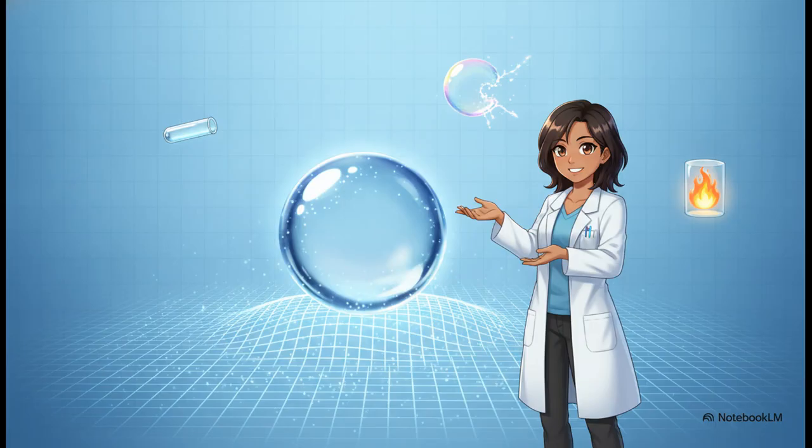So, to wrap up this explainer, what are our key takeaways? We've seen that surface tension isn't magic. It's an elastic sheet born completely out of unbalanced cohesive forces at a liquid's interface. We've explored how scientists tackle the invisible using some seriously ingenious mechanical, rotational, and pressure-based tools. We've got hard data showing water's uniquely strong surface tension compared to common oils, and finally we saw how temperature acts as a master switch, fundamentally altering those microscopic bonds.